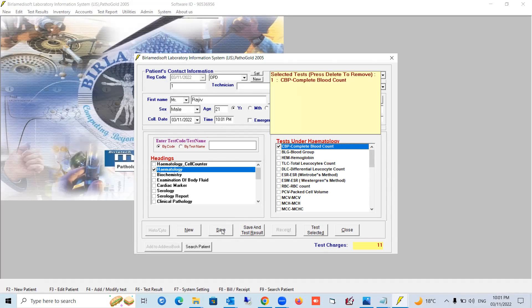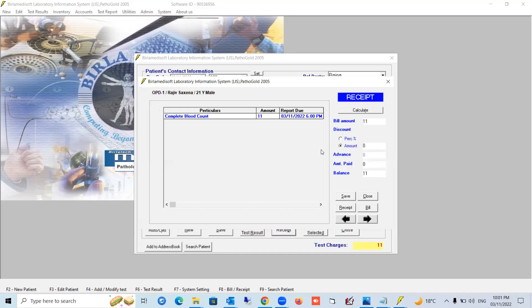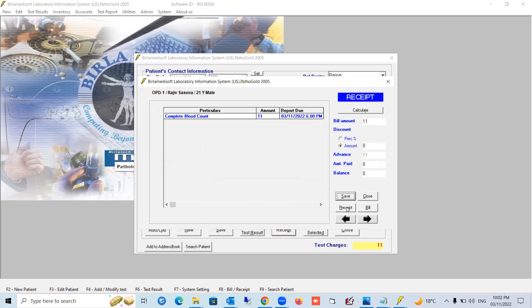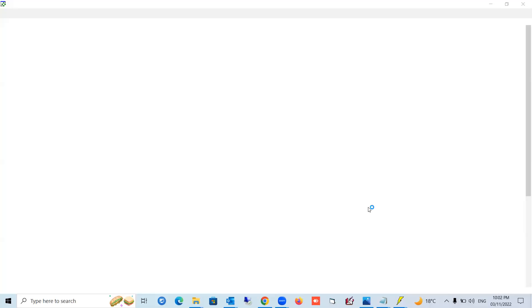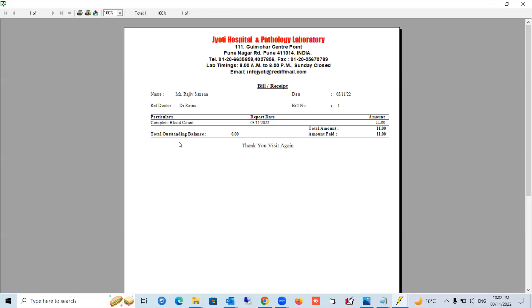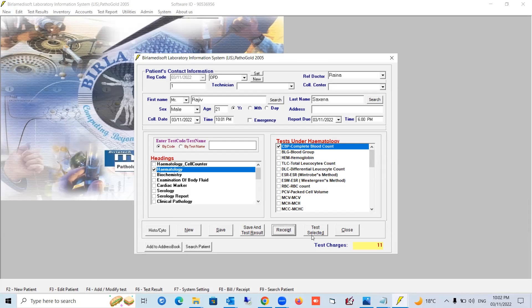Once you've selected the test and want to save and proceed to billing, press the Billing button. A receipt screen appears. Type the bill amount and amount paid, press the Save button, and take out the bill. The bill has been generated completely. Now billing is done — close this window.